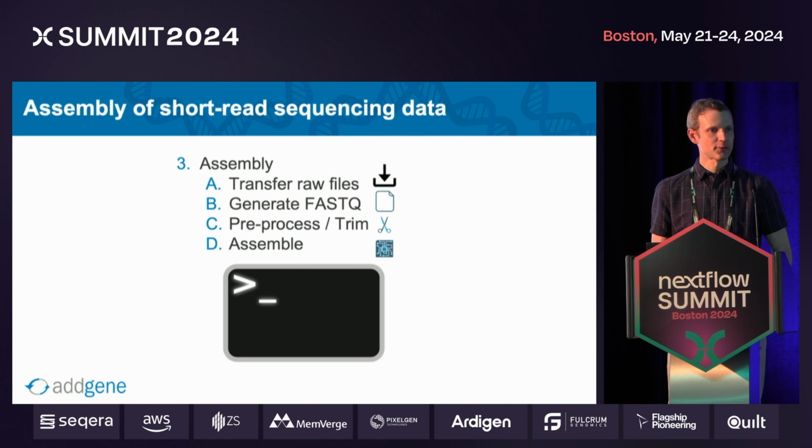And as we were doing this, we ran into some disadvantages to our initial prototype, which I'm sure will sound familiar. We had to use the command line for everything. It was one step at a time. You have to closely monitor everything. It's not easy to train others to do this. And we were initially limited by just the available compute resources that we had at the time.